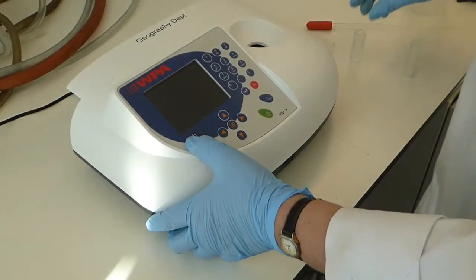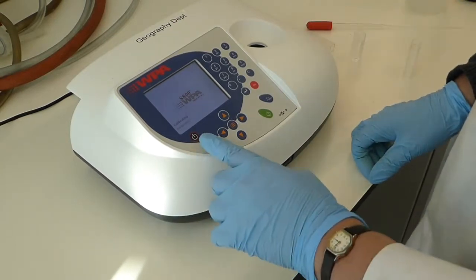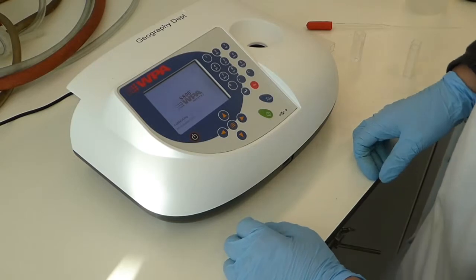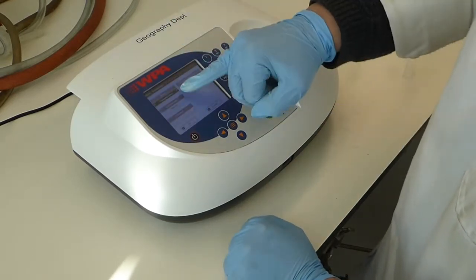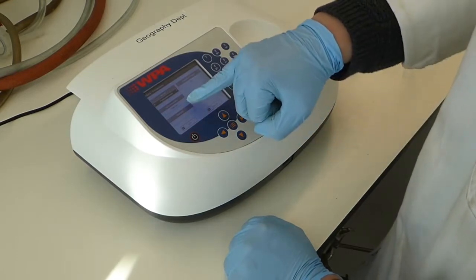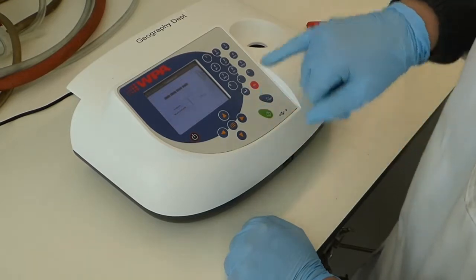To use the spectrophotometer, first you need to switch it on and let it go through its warm-up stage. Then you need to check by pressing number one that you're on transmittance percent and that you're on 540 nanometers. Click OK for that.